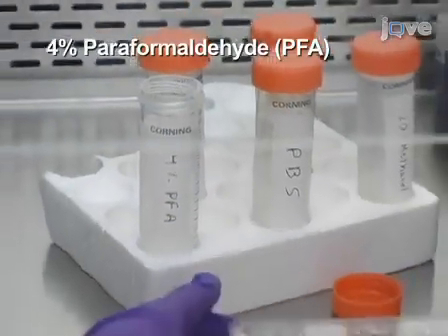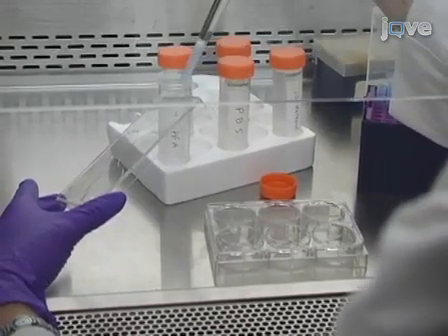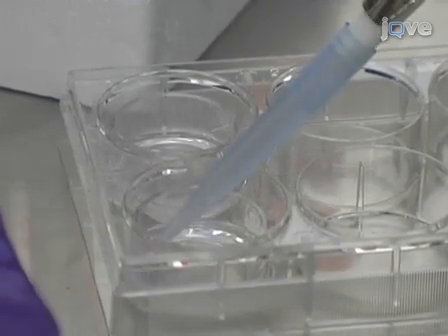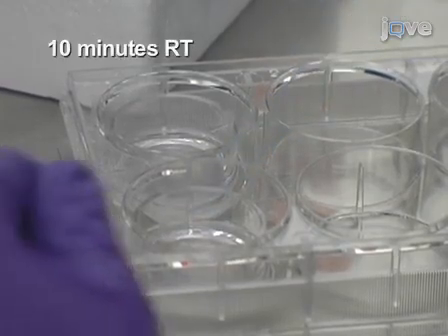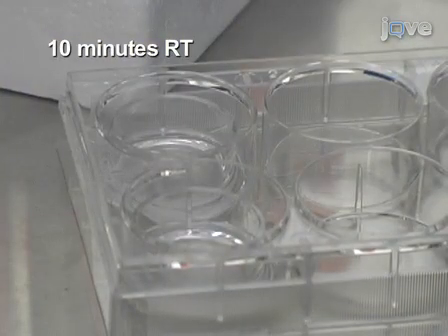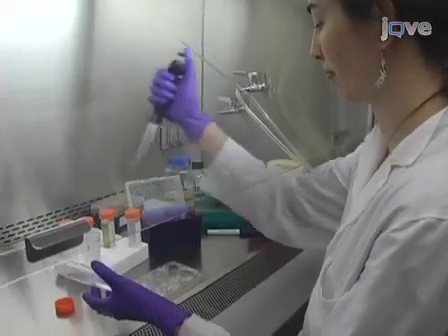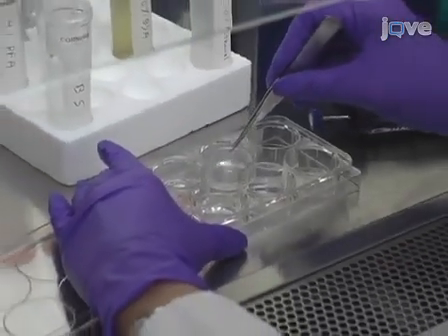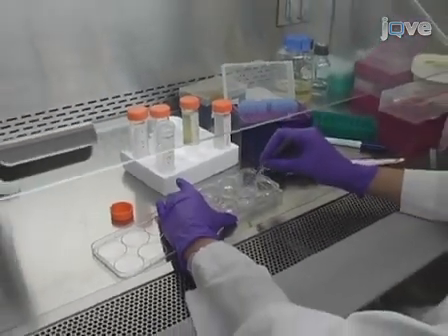Then, fix the slices by pipetting 1 ml of ice-cold 4% paraformaldehyde under the insert and 1 ml of PFA on top of the insert. Allow the slices to fix in the PFA for 10 minutes at room temperature. After 10 minutes, aspirate the PFA and wash briefly with 2 ml of cold PBS, pipetting 1 ml on top of the insert and 1 ml below the insert.